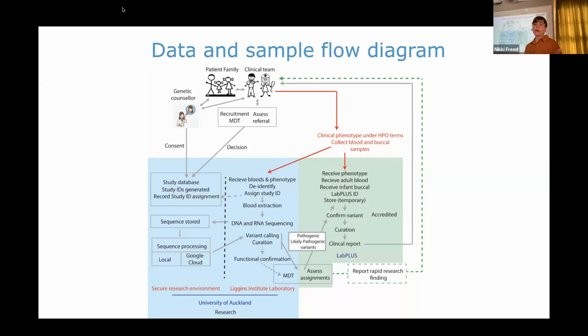We'll get the blood samples and do DNA and RNA extraction and sequencing. We'll be doing this on the PromethION P2s. And we'll be separating the parents on each flow cell, and the child will be done on at least two flow cells to gain that extra coverage. And so we'll be looking at a minimum 30-fold genome coverage for those.